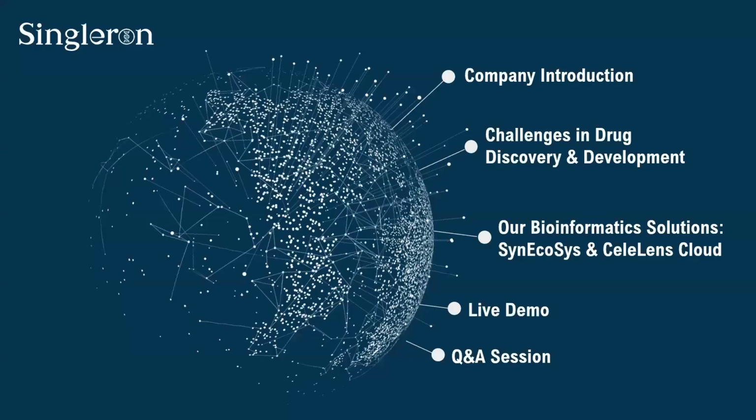The webinar today is dedicated to the demanding process of drug discovery and development and how to accelerate it with single-cell data tools. So after an introduction into the topic by myself, Denise will walk you through the software in a live demo. And any question that you might have during the webinar, you can enter via the question and answer function of the Zoom window, and we will collect the questions, and there will be a question and answer session later on. So let's start.